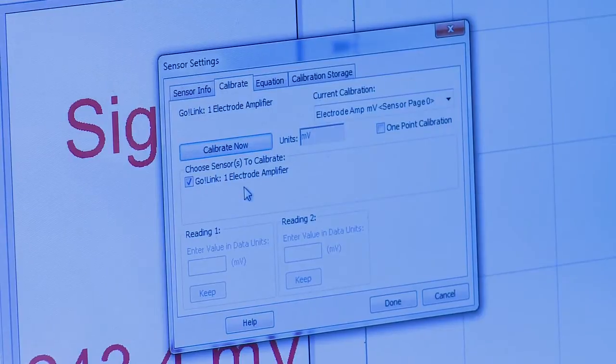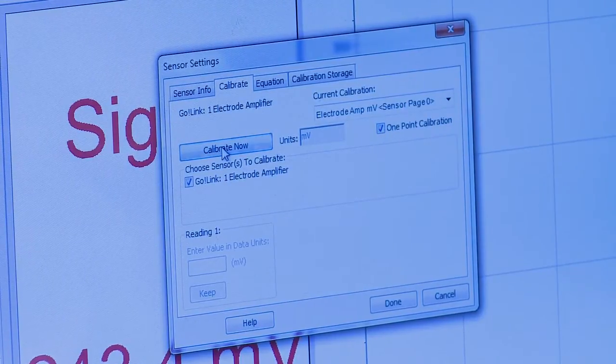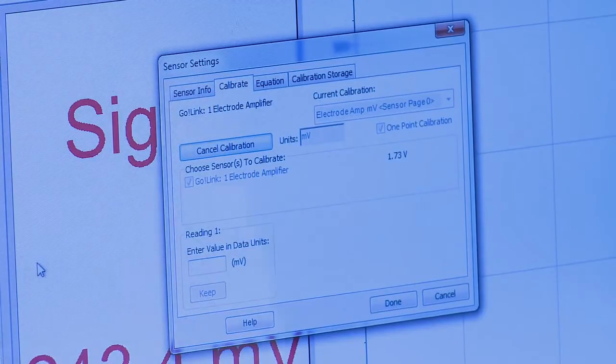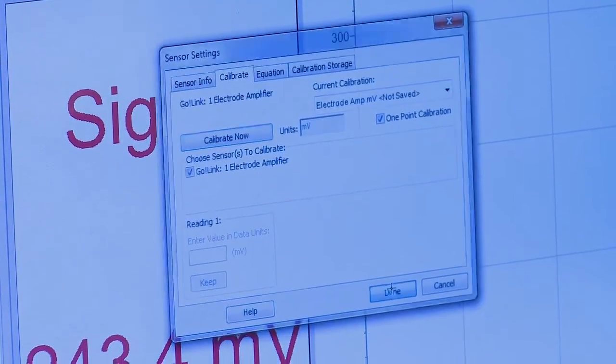In this window, we want to select one-point calibration and click Calibrate Now. And then we enter a value here of 320. Press the Keep button and click Done.